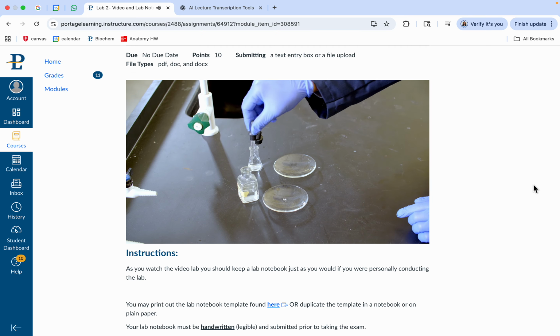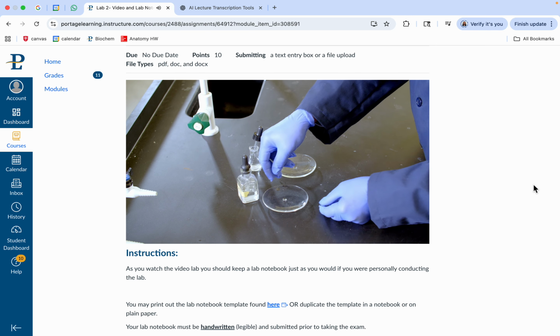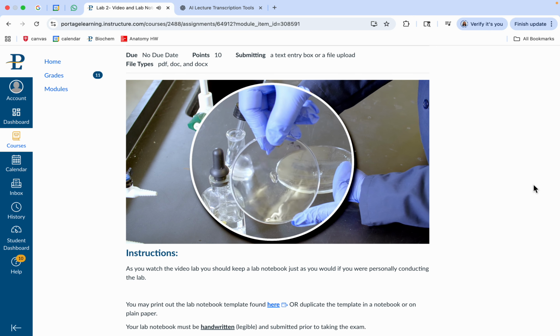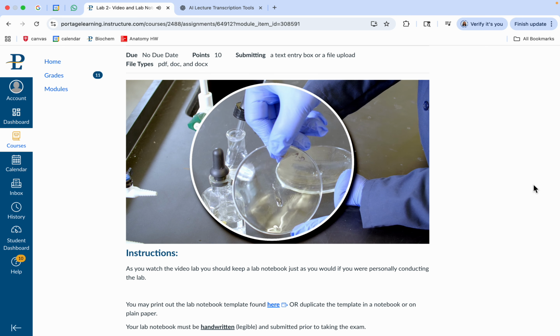All right, so let's put a drop of glycerin right there. I'm sorry, a drop of glycerin. We'll use glycine later, and a drop of water. All right, so first of all, I'll test the glycerin. I move this up, and notice we do have our liquid bead there, and it's moving down.